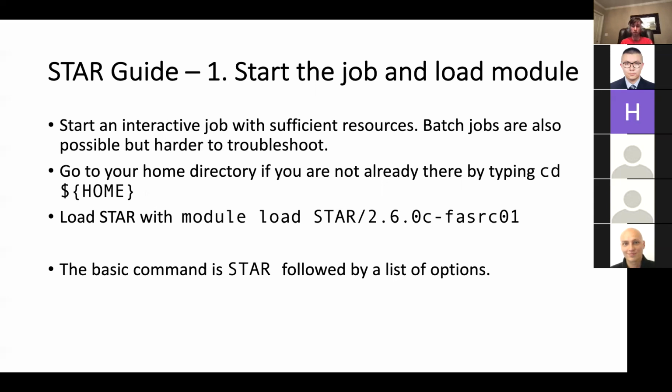Next, you're going to load the STAR module. You can think about this as like in Python, you might import pandas, for example. In R, you might load a library by calling library. This is the same idea. You're just going to load STAR onto the compute node. And the basic command is literally just to type STAR. But followed by STAR, there are a lot of different options that you need to specify to make sure that it does what you want.